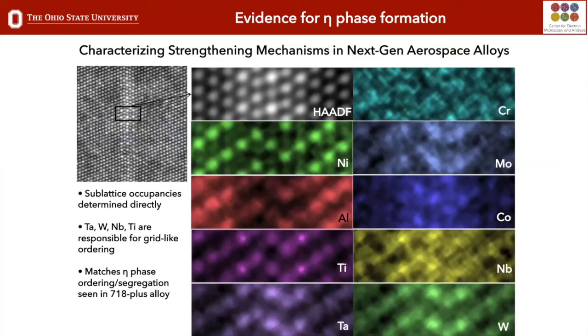And if you have an inorganic material like a nickel-based superalloy, here you can take a beautiful STEM image and show that there are bright elements segregating to something. We know that there's a twin boundary here. But to look at this and be able to do chemical analyses, and in this case, atomic resolution EDS, here we can show where the nickel, the aluminum, the titanium, the tantalum, all the elemental species sit.